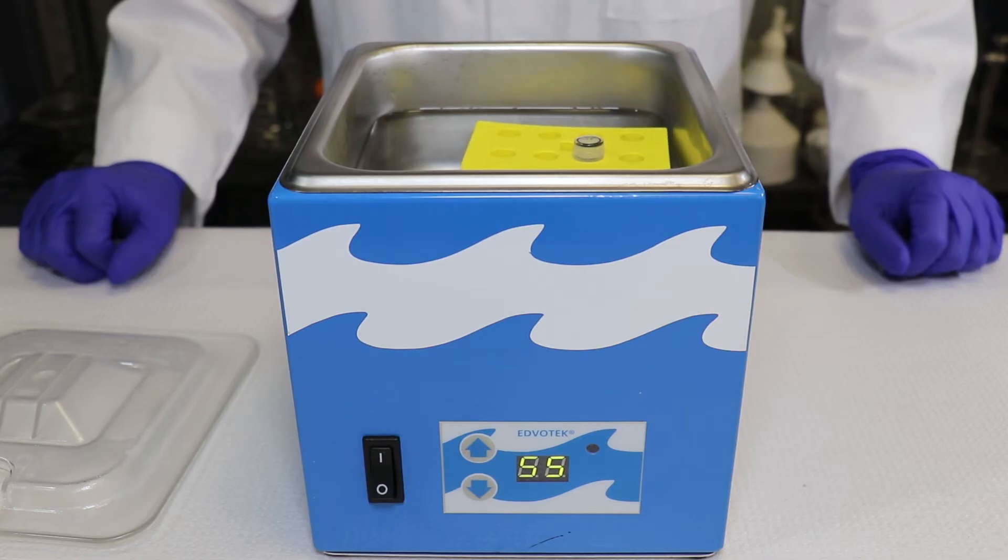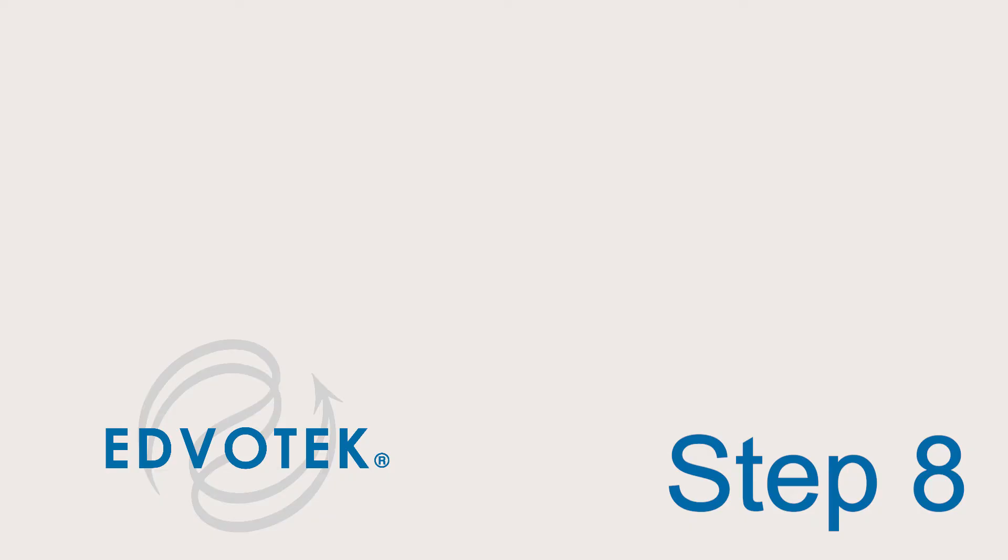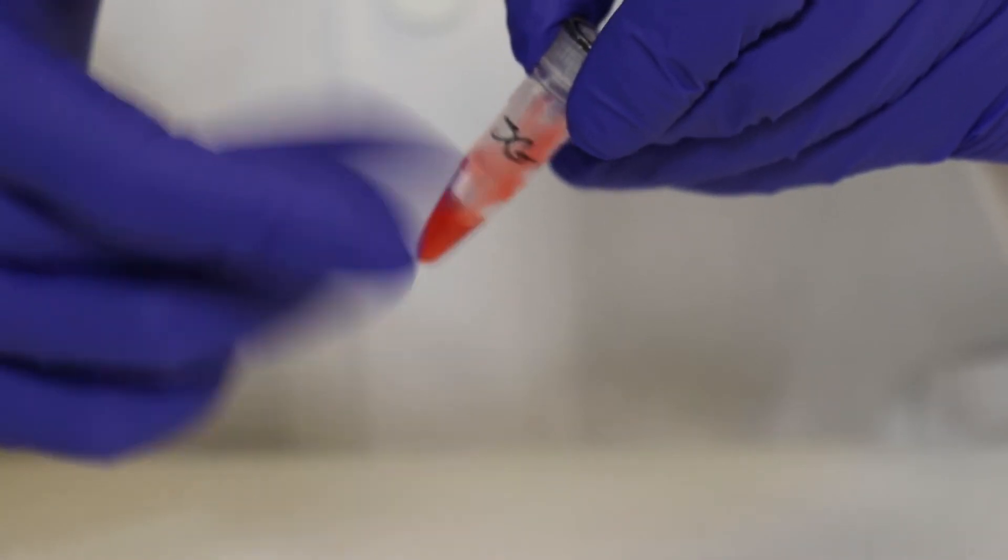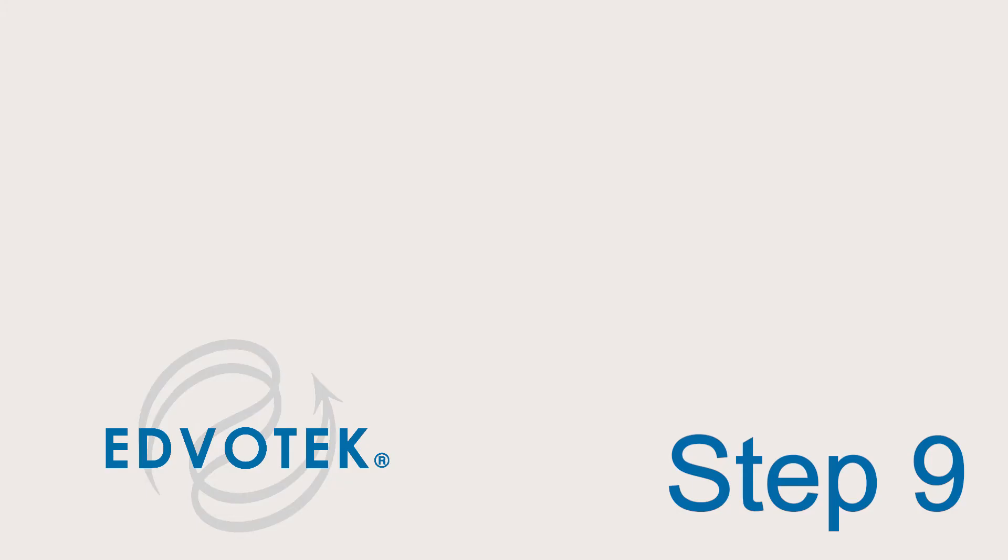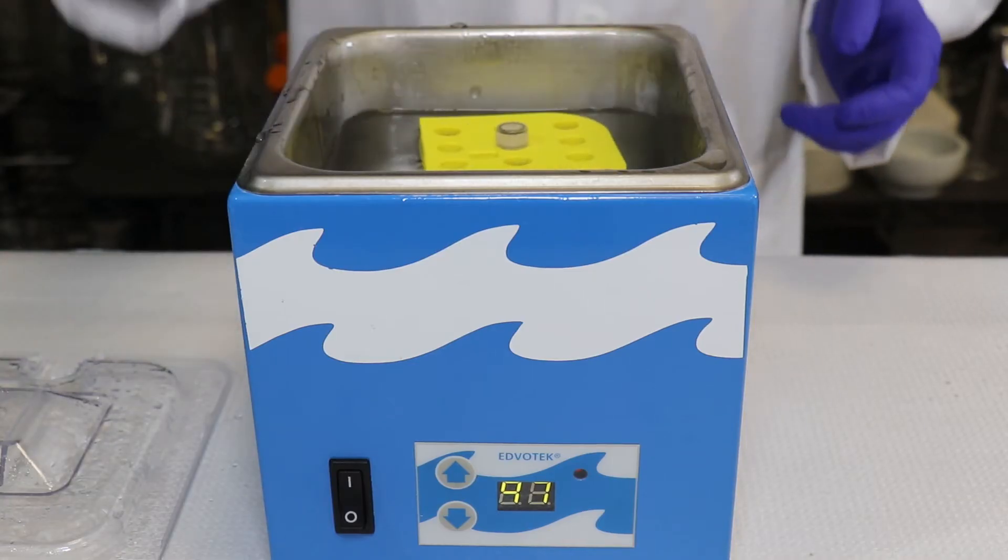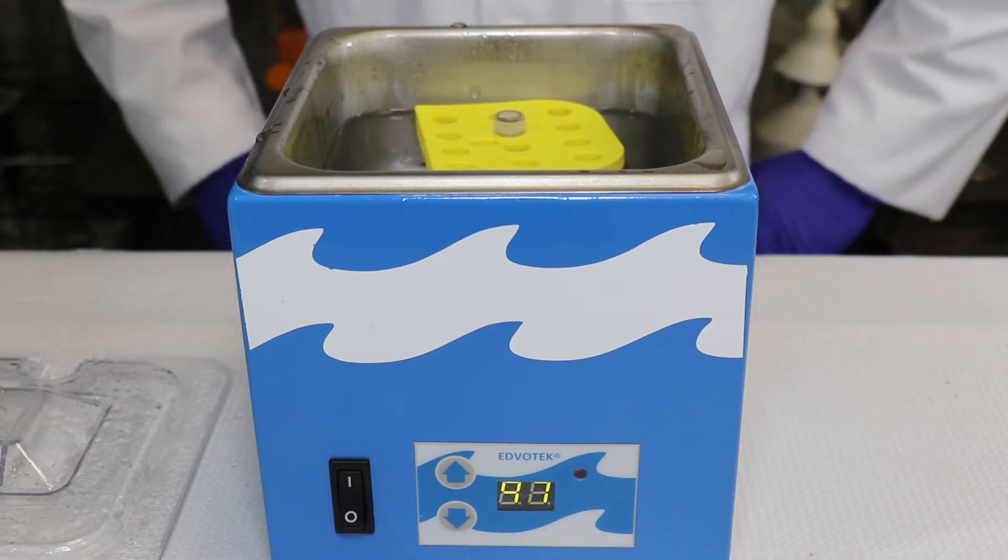Step 7: Cap the tube and place it into a 55 degrees Celsius water bath for 5 minutes. Step 8: Mix the sample by vortexing or by flicking the tube vigorously for 20 seconds.